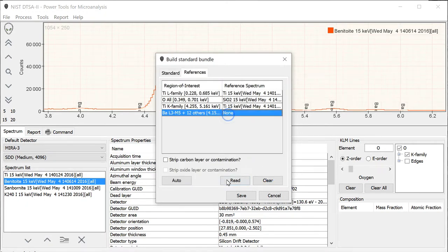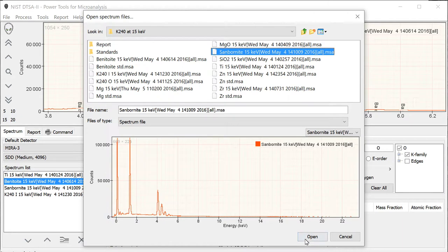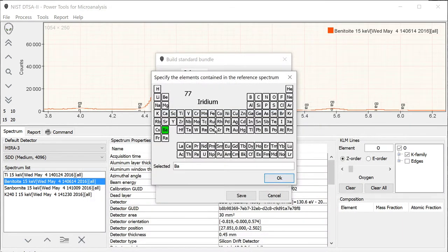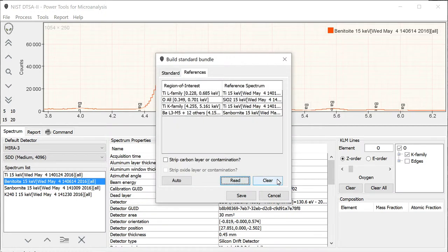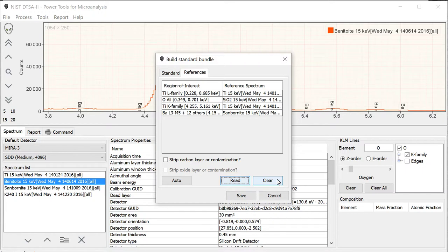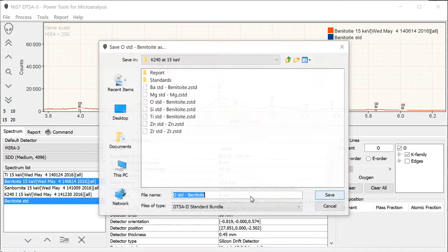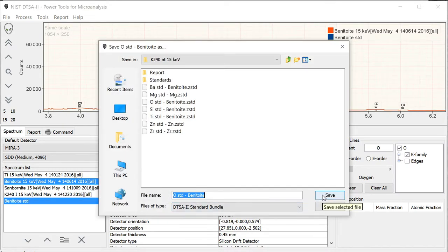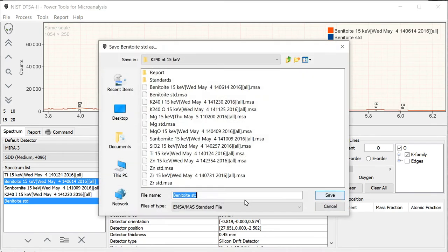Finally, I'm going to use this sanbornite for my reference for barium and barium, silicon, and oxygen in sanbornite. When we specify a reference, we don't actually need to know the composition of the material. So it's really only being used for the shape information. You can use materials that are either beam sensitive or are even not necessarily flat and polished, so long as the shape of the peak isn't modified. This is important particularly somewhere like barium, where finding a good peak shape reference can be really difficult, particularly for the barium M lines. So I'm going to go ahead and save these, and there we go.